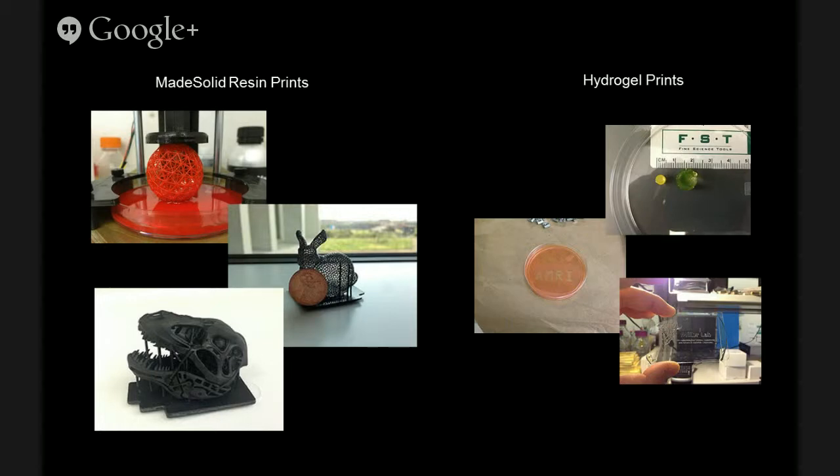Here you see these points. Depending on how this was printed, if you've got certain points that are just totally floating out in space, like if I'm doing my fingertips and I start here, I can print them up, and that's great. But if I've got a fingertip with just kind of dots floating out in space, then there's nothing for it to attach to, and it's going to kind of wash away in that process. Does that make sense? So you can still do really complex open structures with SLA.